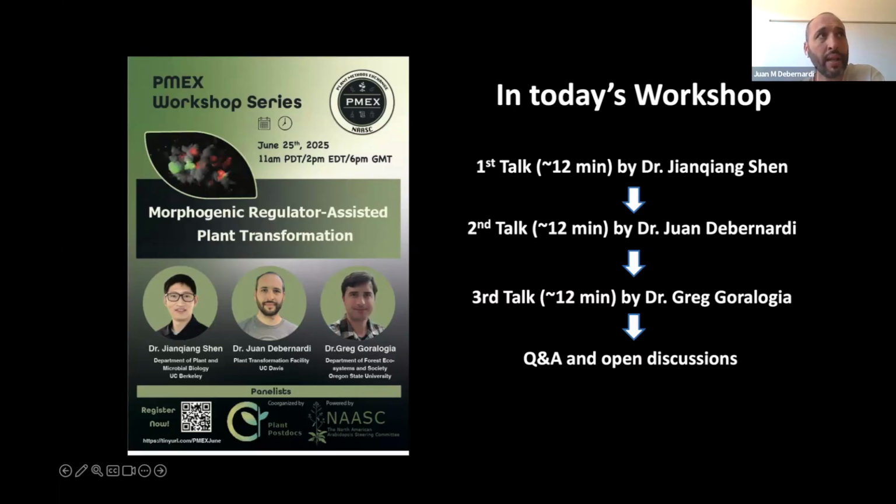But about the DEX being toxic, we found, for example, that tomato doesn't like DEX. At least you had to use a very low concentration, which could be a problem when you have to induce. I was asking the tomato community, because DEX is a very useful system in Arabidopsis, how people in tomato do DEX inducible approaches, but I couldn't get a good answer on that. But we do see some reduction in shoot induction when we add DEX into the plates in tomato.